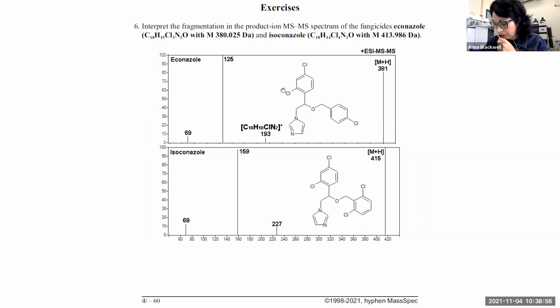I think that I have cleavage on the right side between O and carbon, and in the second position between N and carbon.